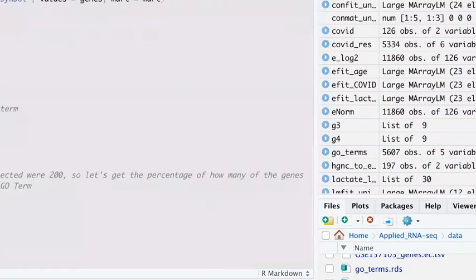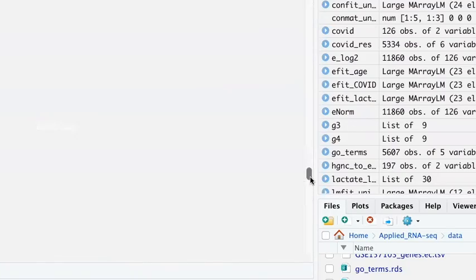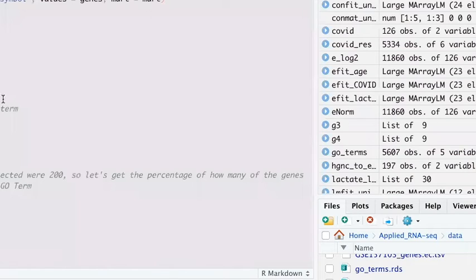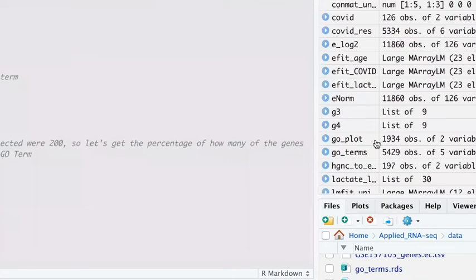I'm just going to put them as empty, because it was not coded as an empty cell. To select that empty cell, I have to actually put in an NA so that I can use the na.omit command to remove it. So you see now the empty cell will be labeled as an NA. That gives us a much easier way of removing these empty entries. I just do that, and then I'm going to count the frequency of each of the GO terms.